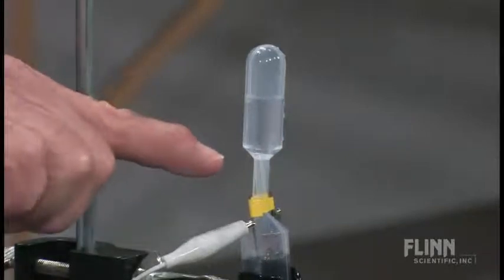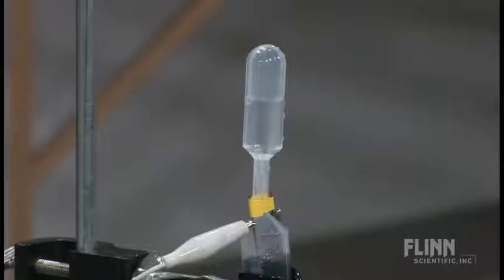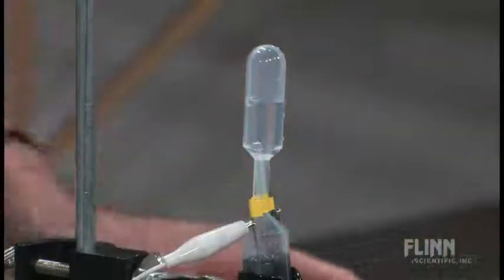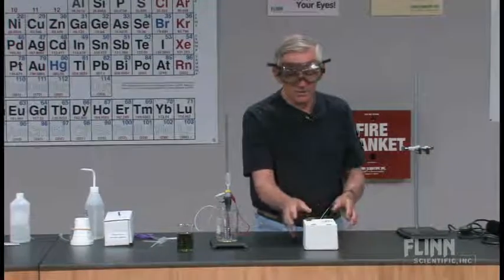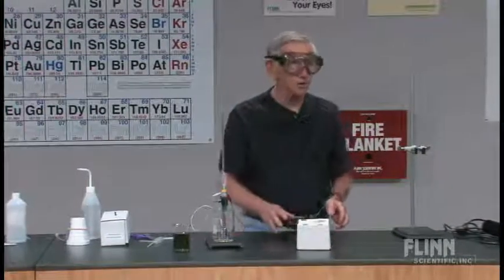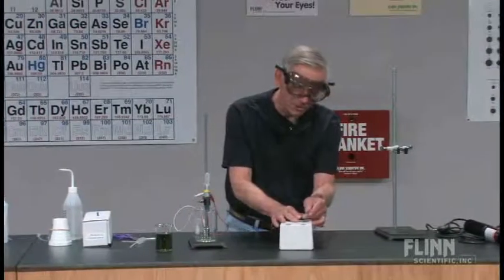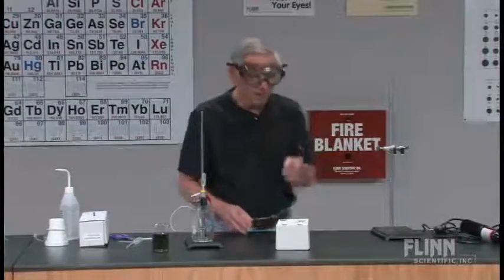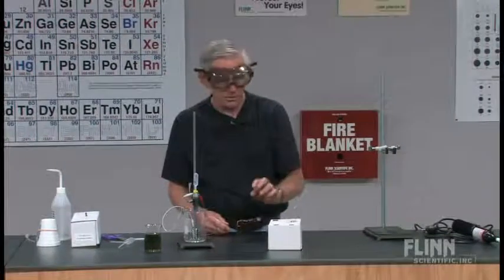I am going to leave a little bit of water in the stem here, because what's going to happen is I'm going to move that pipette bulb onto this high-tech launching device. Again, no expense spared. I'm going to put the pipette bulb over here with a little bit of water as a plug.